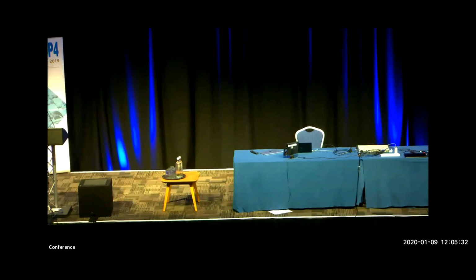They just deposit the map to claim they could do it. Interestingly, there are many apoferritin X-ray datasets. We talked to Paul Adams, who thinks he can now use the new techniques to refine the old X-ray data and do better as well. So in doing all this comparison, you need to look at it critically.